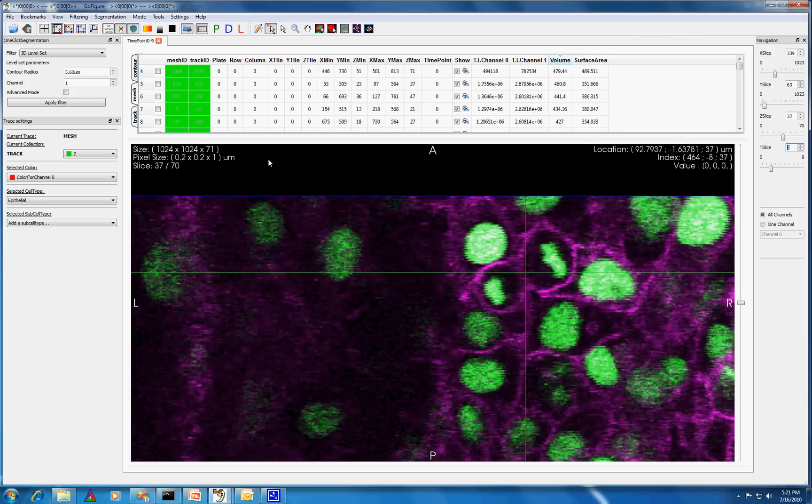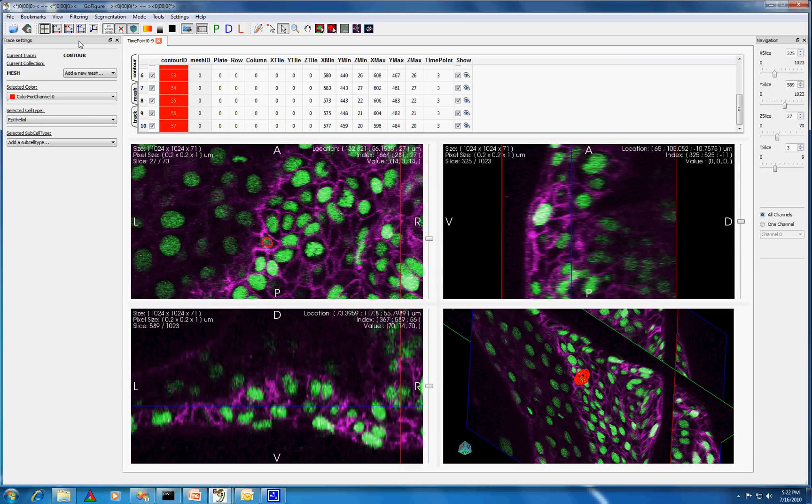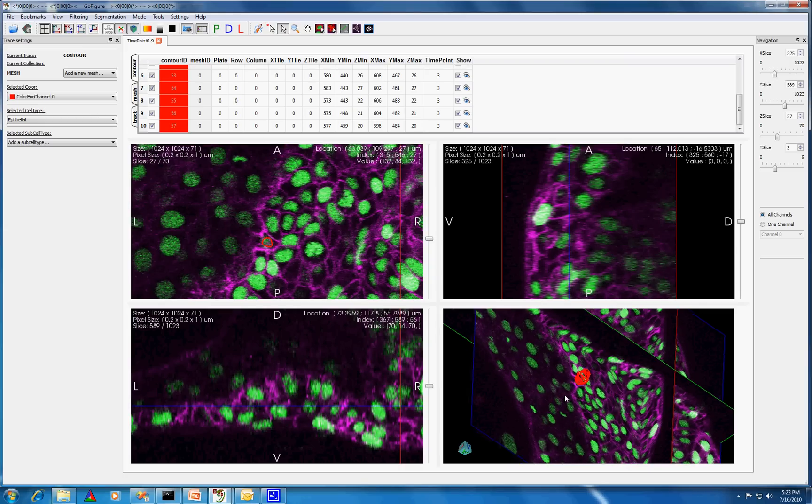Other segmentation methods in GoFigure include automatically generating each 2D contour of a mesh separately or drawing these 2D contours by hand. Here is an example of a few contours which we have already created.